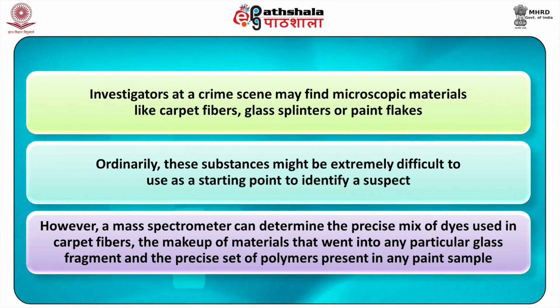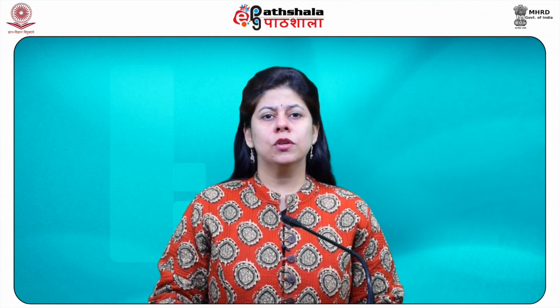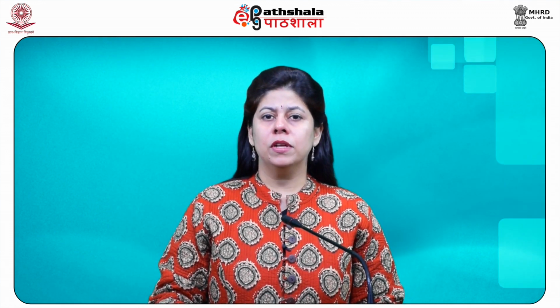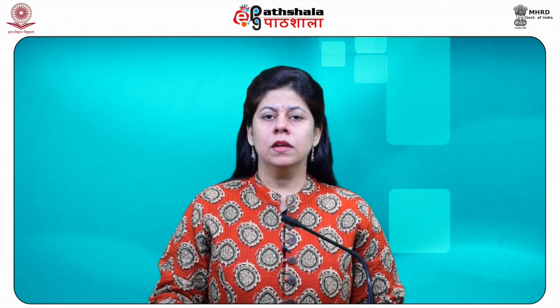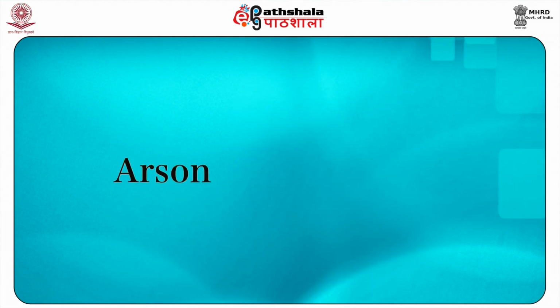However, a mass spectrometer can determine the precise mix of dyes used in carpet fibers, the makeup of materials that went into any particular glass fragments, and the precise set of polymers present in any paint sample. This information can lead investigators to a particular manufacturer who may be able to narrow down where a given sample came from, helping detectives to identify suspects and build a case.